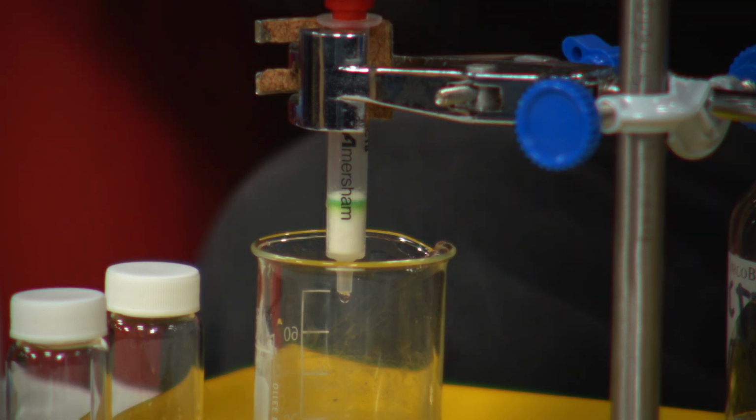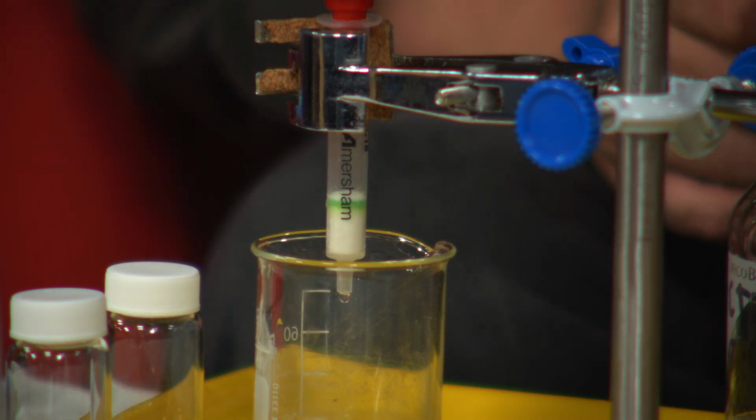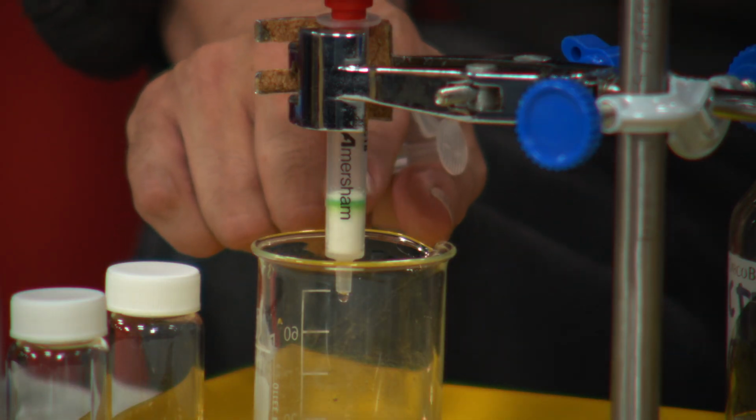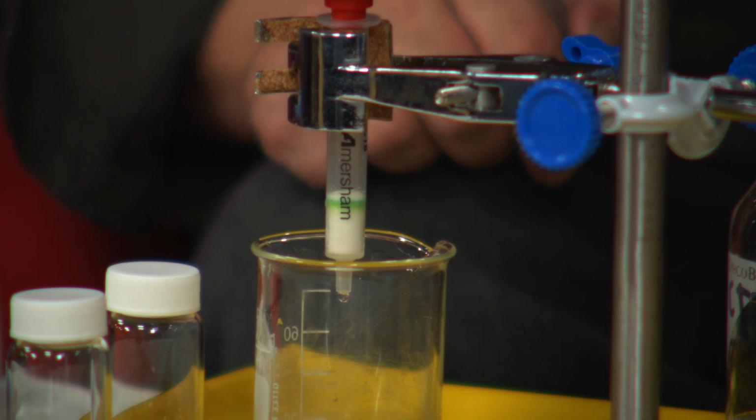And what we're going to do is essentially separate, we've got two solutions that I prepared, hopefully labelled correctly 1 and 2. They've got different compositions essentially. So this stuff, the mixture, is essentially stuck to the top of the column material. And what we'll do is push through these two liquids.